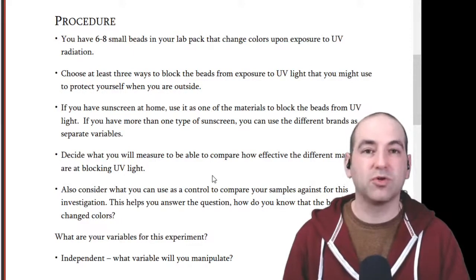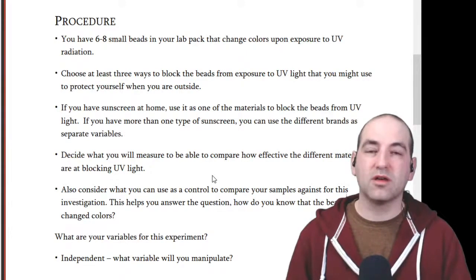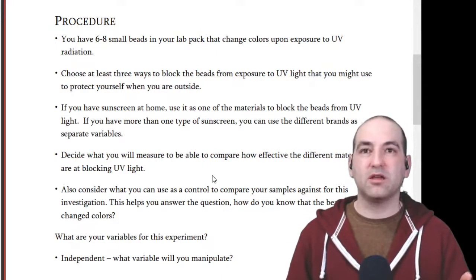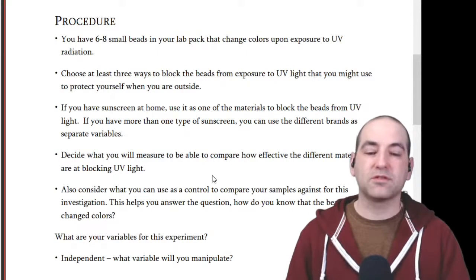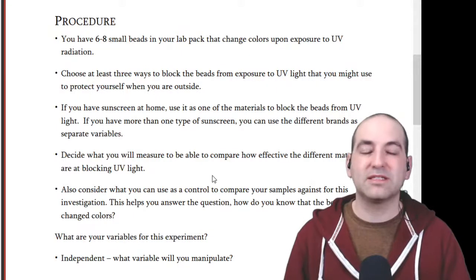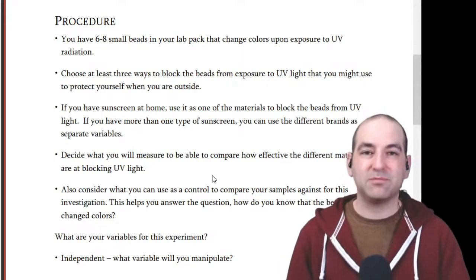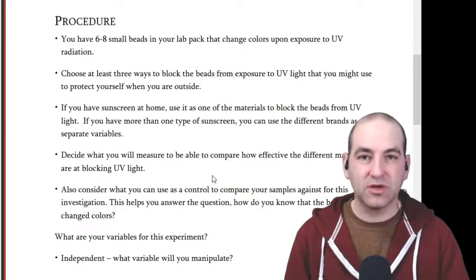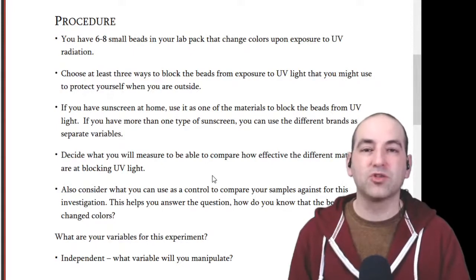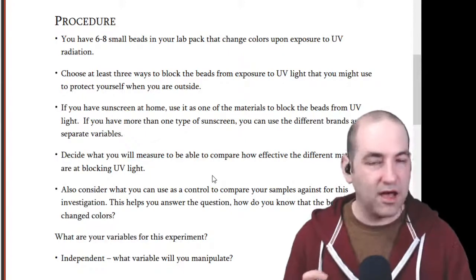There's also the issue of control. What does it mean to have a control? Is the control always just the bare bead? I would say, depending on what you're doing, maybe not. So for example, what if it turns out that the actual cream itself can block UV light, not the SPF ingredient, not the actual sunscreen ingredient, but just some cream on the beads is enough to do that. If your control was just sunscreen versus bare bead, you wouldn't be able to tell.